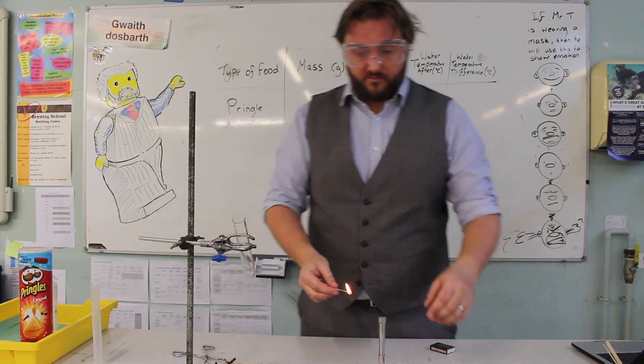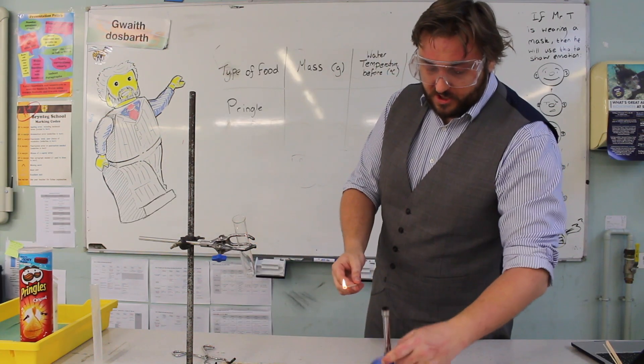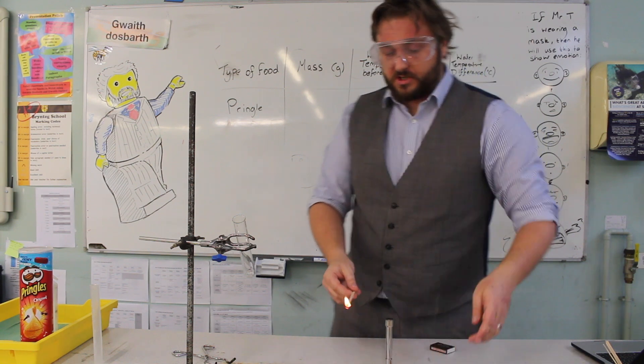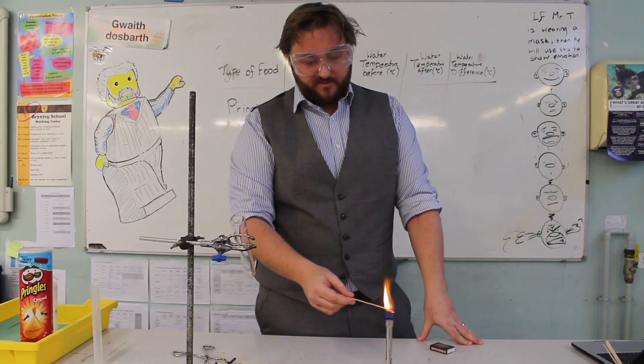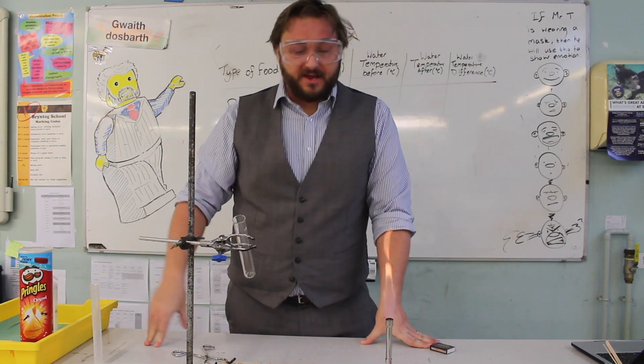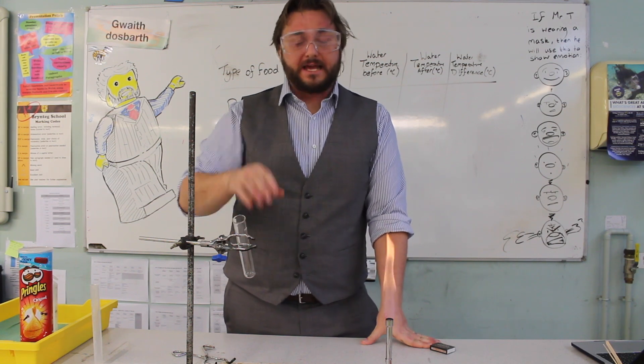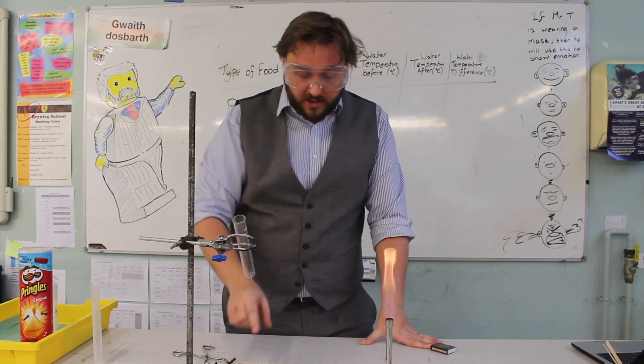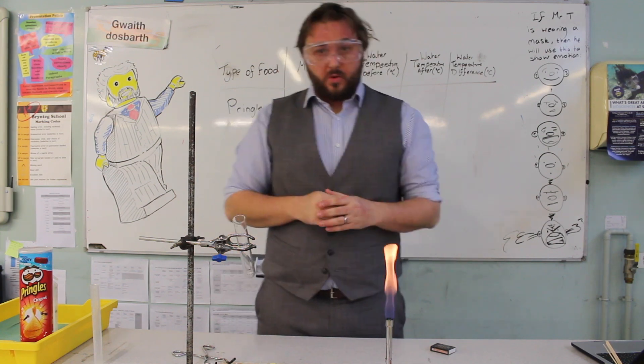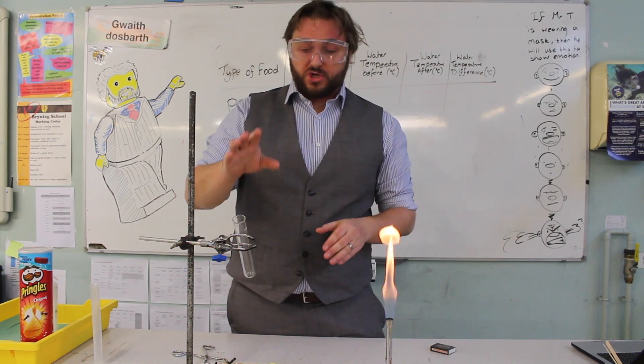The first thing you're going to do is light your Bunsen burner. The reason for this is because you're going to use a Bunsen burner to light your crisp on fire. A common misunderstanding here is that we're using the Bunsen burner to heat up your apparatus. You're not. You're only using it to light your crisp on fire. Once your Bunsen burner is lit, we can just leave that on.